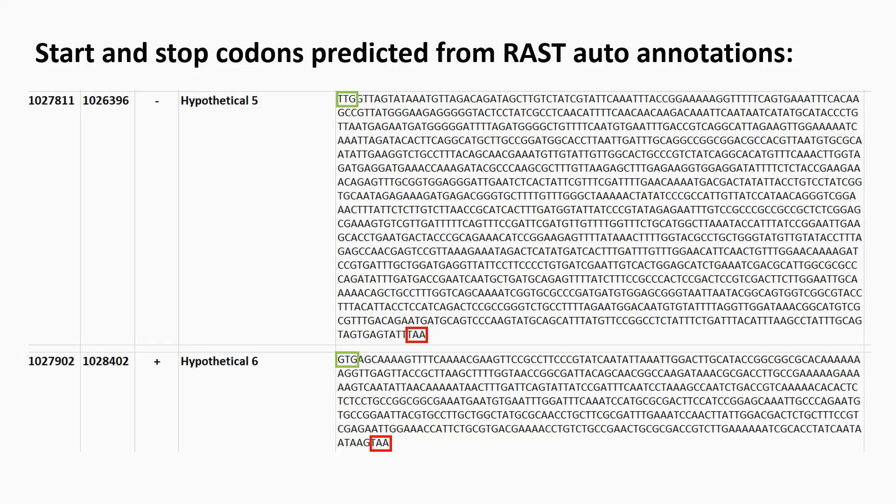So the stop codons I'm happy with, but it's the start codons, especially this one here, that I was a little bit worried about.